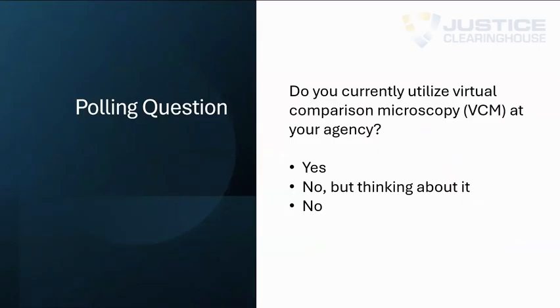Here's our first polling question, Aaron. The question is, do you currently utilize virtual comparison microscopy, VCM, at your agency? A little less than half of the audience said no, but they're thinking about it. 31% said yes, they currently do, and 24% indicated no.